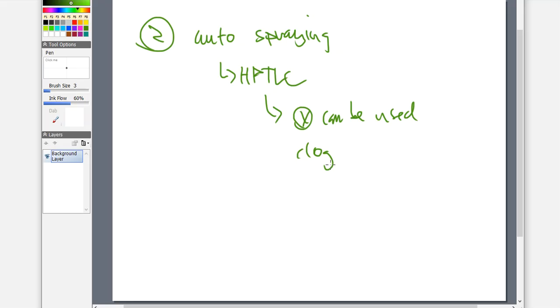And then I'm relying on a spray nozzle in order to do the job. I want you to think about maybe a hairspray can, because it seems like I keep referring to hair dryers and hairsprays and everything else. But if you hold down that hairspray can, you are going to get a chance of clogging the nozzle up. And that clog is going to cause a problem. And then your spray is not going to come out. It's not going to work, or it's going to come out and it's not going to be a uniform mist. The same thing is happening here with the auto sprayers. So the good thing is that it is automated, so it is safer.